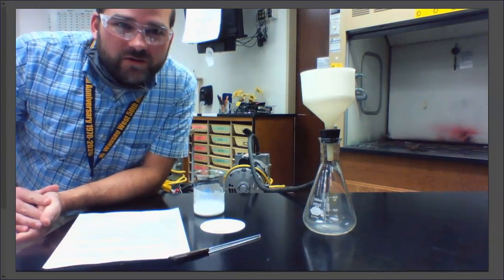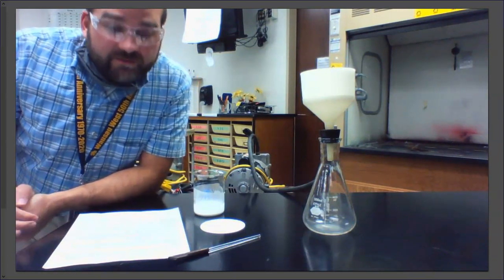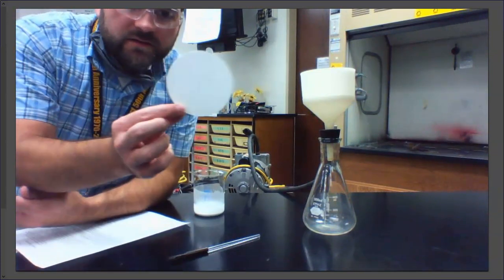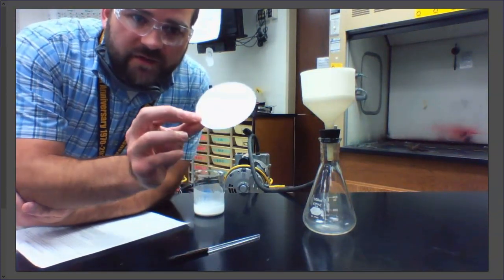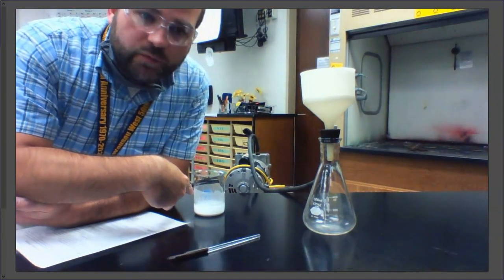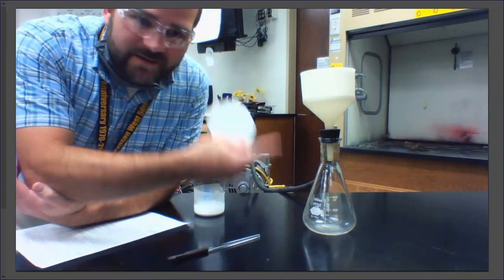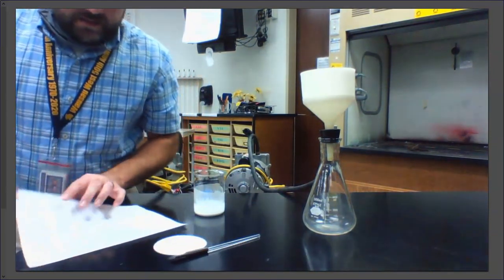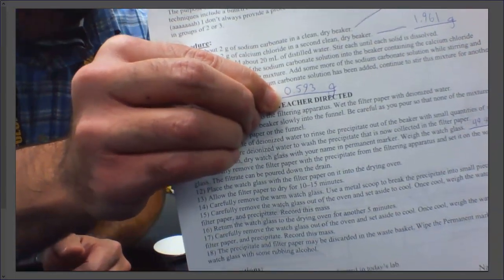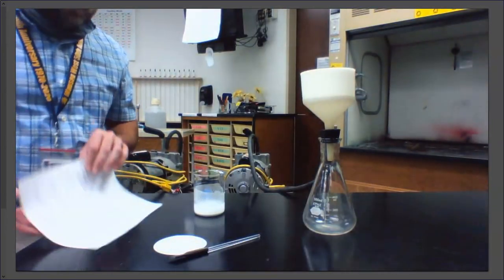Okay, so I've moved over to the other side of the room where I have my filtering apparatus set up. Step 5 in your procedure said that we should weigh a piece of filter paper. This little paper disc is filter paper, all right? So we are going to be pouring this precipitate and solution through the filter paper in this apparatus. I did take and record the mass of the filter paper right there. So my filter paper is 0.593 grams, all right? Again, we'd like to record that.